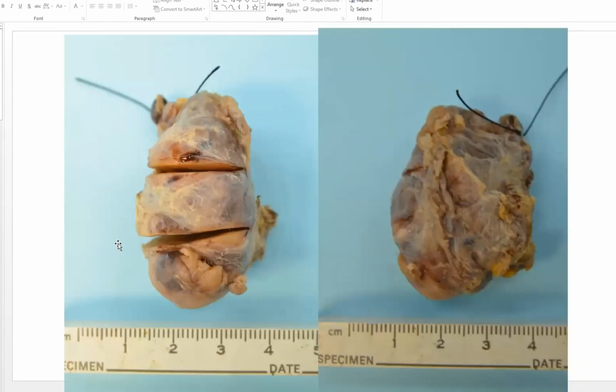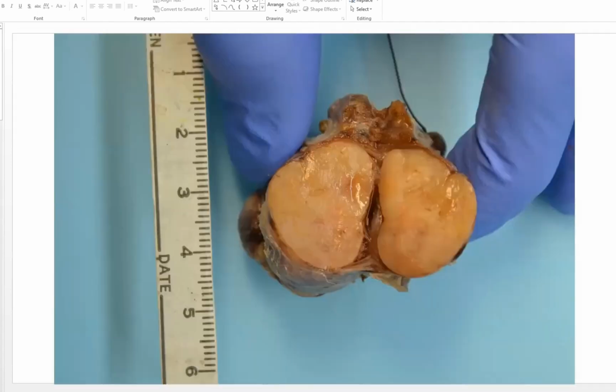This second specimen has almost an entire lobe involvement, both from an inferior on this, sorry, what did we call it? A hemi? I think we call this a hemi, yeah. But the difference here is this more homogeneous kind of look. If it wasn't clear, the overarching theme for today's session was follicular lesions. And you can have different types of cut surfaces. This one lends more towards what people were talking about, that this is probably more neoplastic on the benign side of things, given the homogeneity of the cut surfaces that we're seeing.